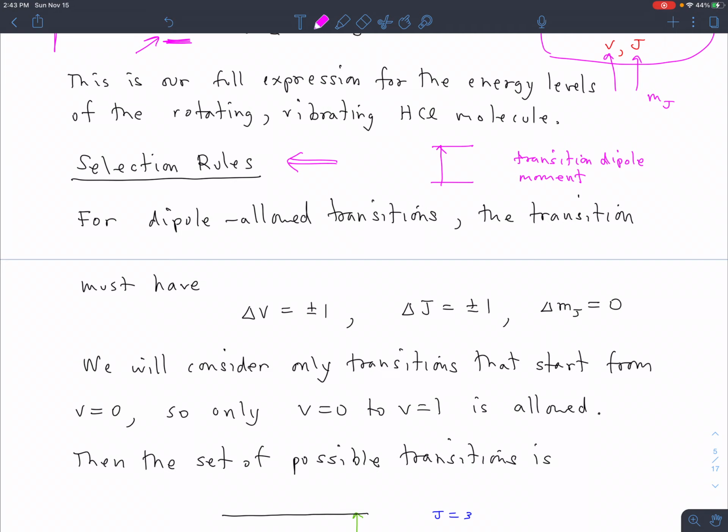The transition dipole moment is often 0 for symmetry reasons, and when it's 0, the transition is forbidden. And that means for an ideal molecule that followed the theory exactly, you wouldn't see the transition at all. In a real molecule, it doesn't follow the theory exactly. There's always small corrections. It means that it's a very, very weak peak, and so compared to the allowed transitions, it gives rise to only almost invisibly small peaks in the spectrum.